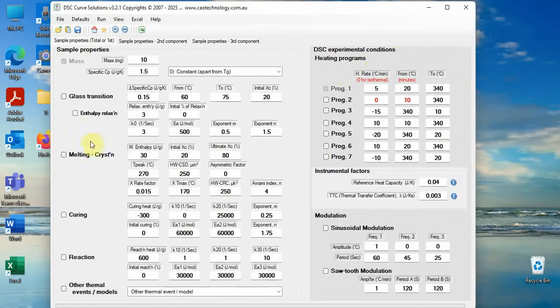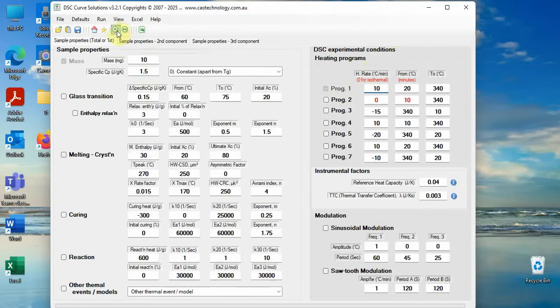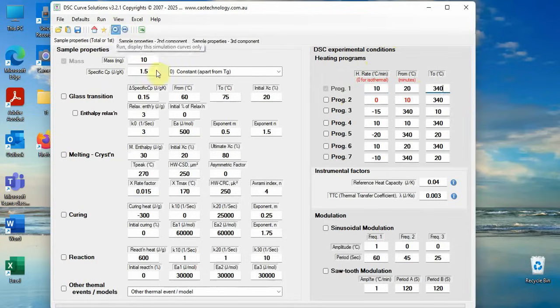Assume your sample mass is 10 mg and specific heat capacity 1.5 joule per gram per k. You make a DSC run at 10 degrees per minute from 20 to 340 degrees centigrade. Put the numbers into the boxes, then click button run. Simulation is running.